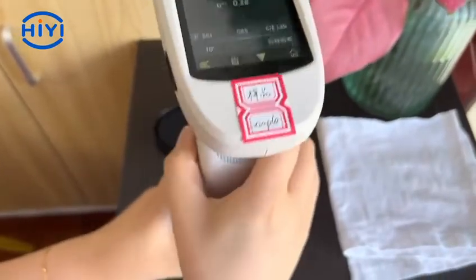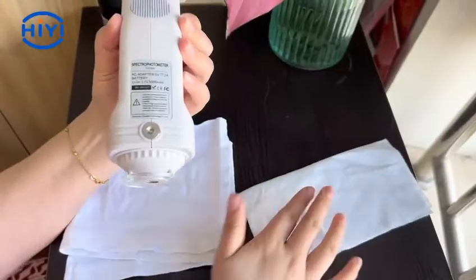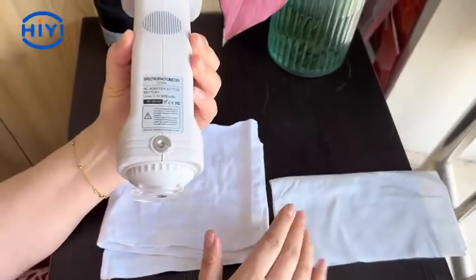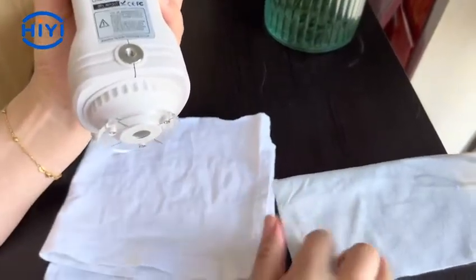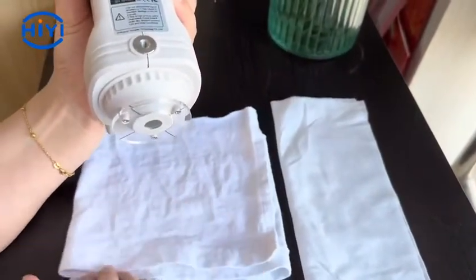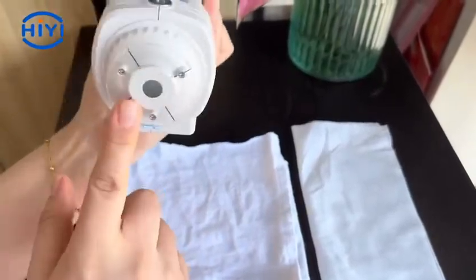Ok, we are doing the white calibration now. We finished the calibration. Now I will test the two pieces of clothes. The left one is normal fabric and the right one is normal fabric. In normal, we use the large diameter to test the fabric.